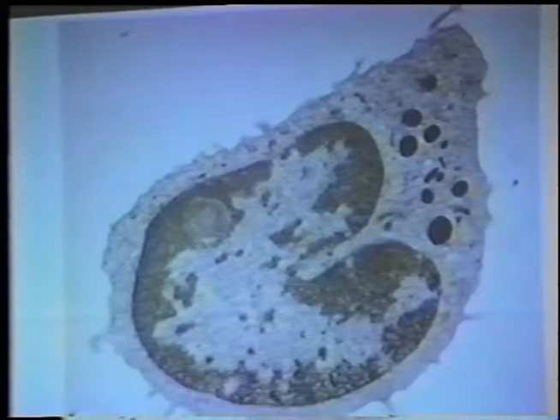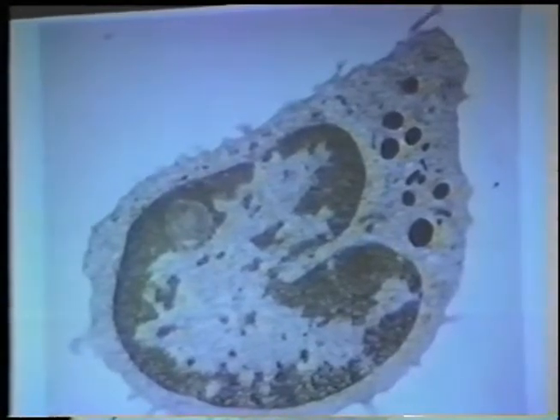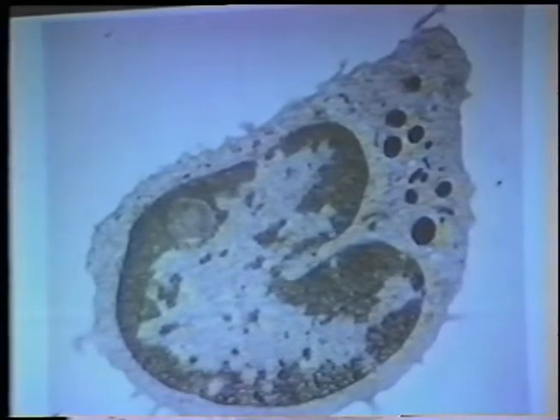But just to pursue one more step, were the cells that were more towards the edge of the slab generally better preserved than those, say, in the inner part of the zone, or whatever the zone might have been? Or did each cell have its own difficulties? Okay. Since it is an inhomogeneous system, you would expect to see some inhomogeneities in the freezing in both directions.